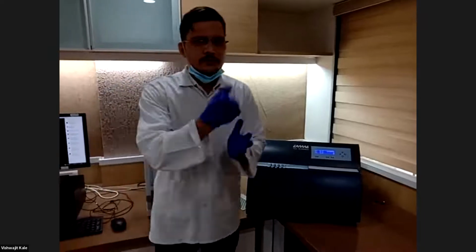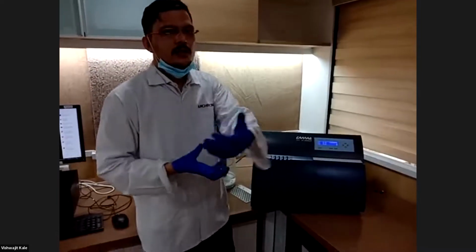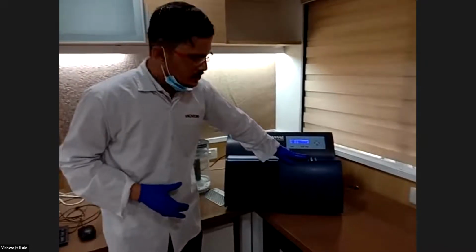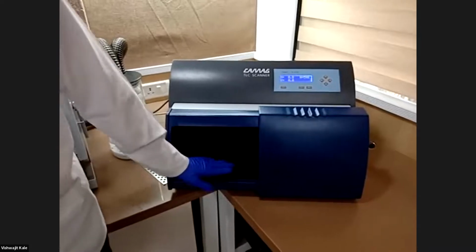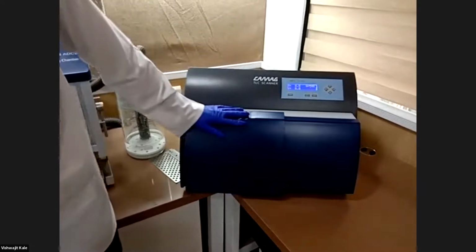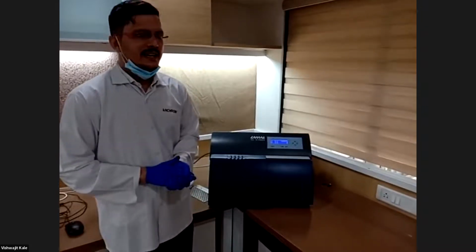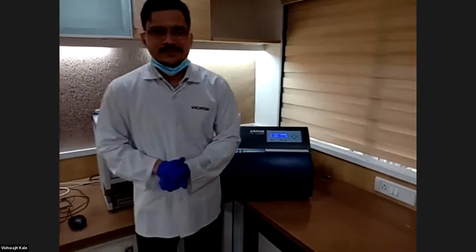Suppose we want to find out the absorption properties of separated molecules. We can capture the absorption spectra of that molecule from 190 nanometer to 900 nanometer easily by using this CAMAG scanner. The operation is very simple. Just open the shutter of the scanner. It is software controlled, connected to the VisionCATS software, the latest software. Keep a 20 by 20 or any smaller plate on the stage and close the shutter. All the parameters you can set in the software, and you can generate chromatograms, spectra, etc. Calculations are also automatic, which I will show you during software operation.